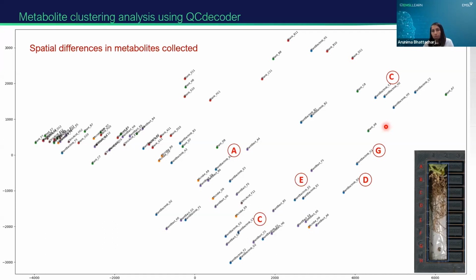Perhaps there is some kind of signaling between a plant root and microbe, or maybe in some cases there is some kind of deficiency. We can do different kinds of drought experiments because we can control humidity with our humidity chamber, if drought experiments are a goal, for example. We haven't done more research into plant and microbial metabolites in these platforms with just agar. We just looked at soil metabolites, but we can also incubate these plants in agar if you want to get a better idea or image of a plant root as it is growing.